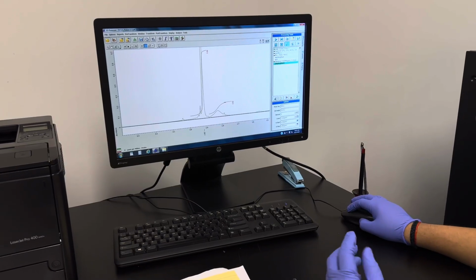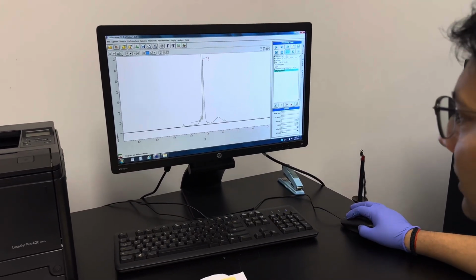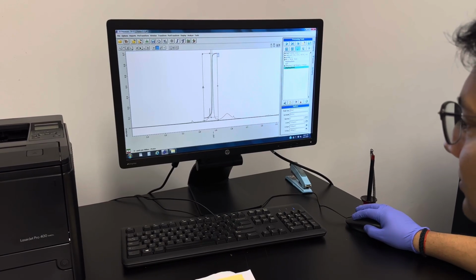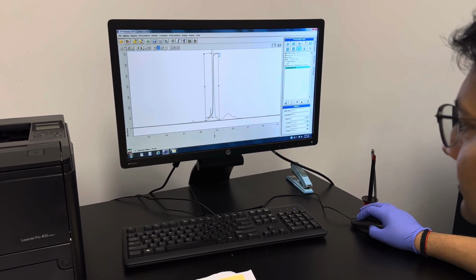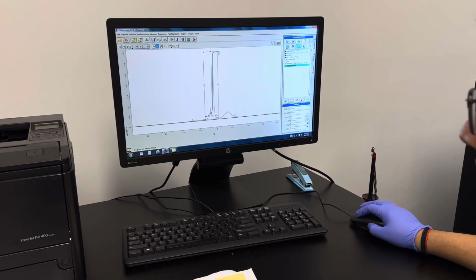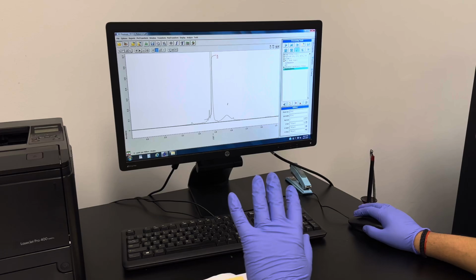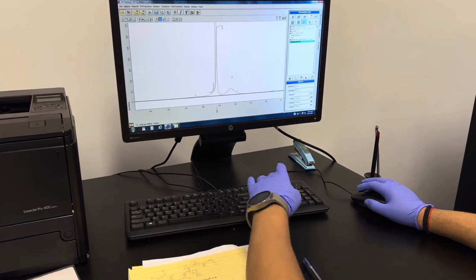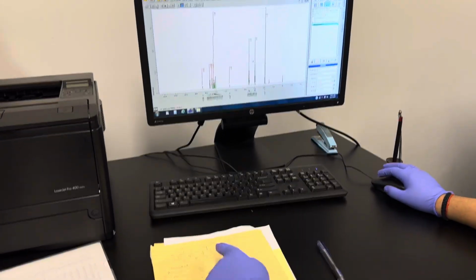This is some water maybe or some peak may have come. And then slightly you can play around, but make it like 3.02, 3.05, 3.04. So you got this 3.